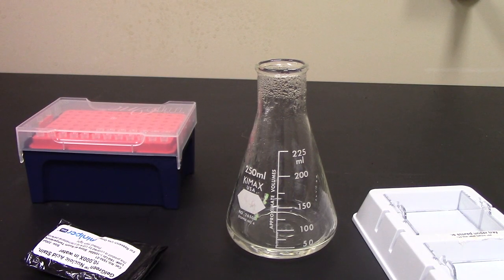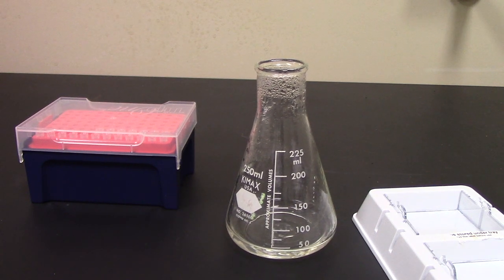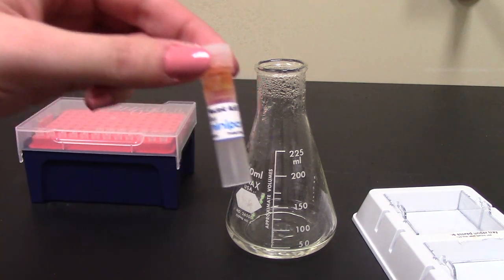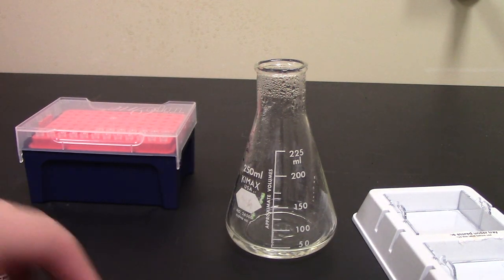Now that my gel has become cool enough to touch, I am going to add the gel green nucleic acid stain. Again, I'm making a 3% gel—I had 0.6 grams of everyday agarose and 20 milliliters of 1x TBE—so now I'm going to be adding 2 microliters of the gel green nucleic acid stain.